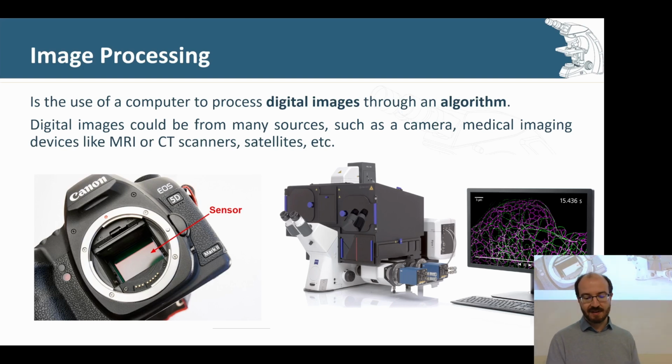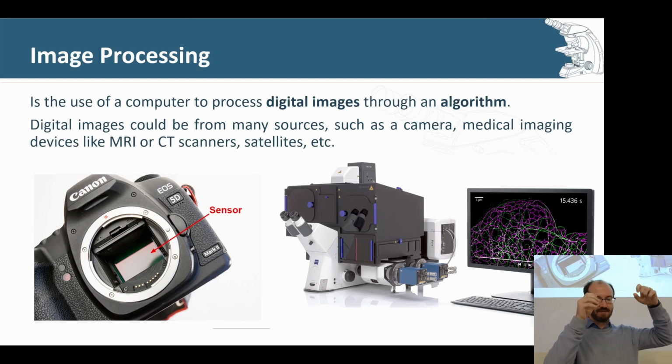There are certain other things to maybe just also realize. You get different types of sensors. You get global shutter sensors, and then rolling shutter. So what that means is global shutter means that it fills up these buckets, and then in one shot it reads all of them in parallel. Rolling shutter is where you read them top to bottom.